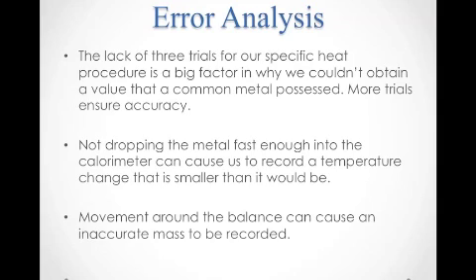and our procedure could have just gone overall much, much smoother. And additionally, our mass isn't perfectly accurate because to measure mass, we put a weigh boat on the balance and then zeroed it and then put our metal in. And if things shifted about, the mass could have gotten measured incorrectly because the balance is very, very precise. And if the weigh boat shifted over a bit, it would sense it differently and come up with a different mass.